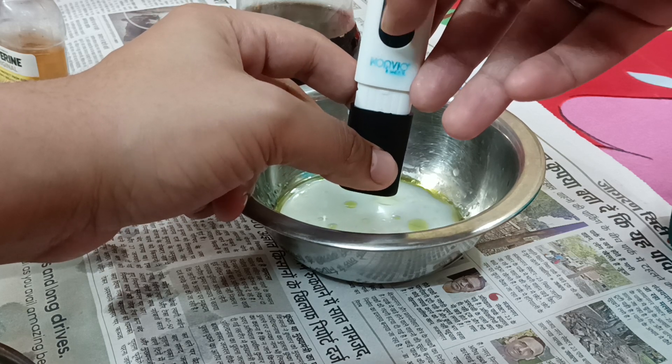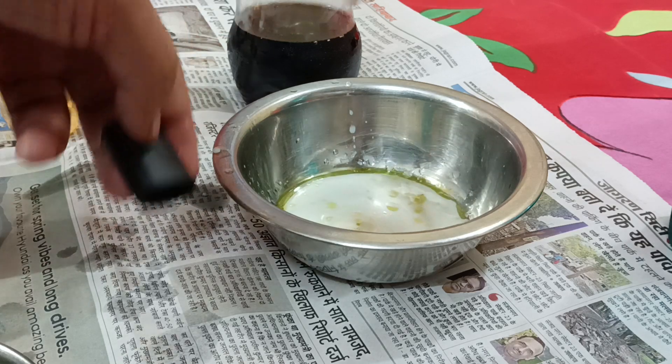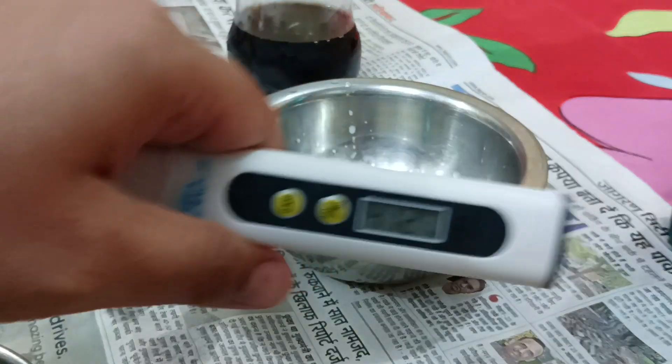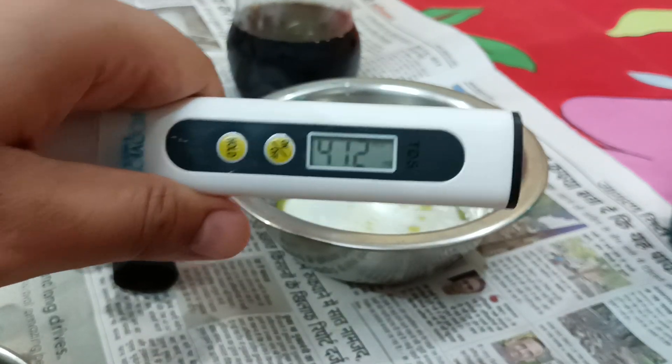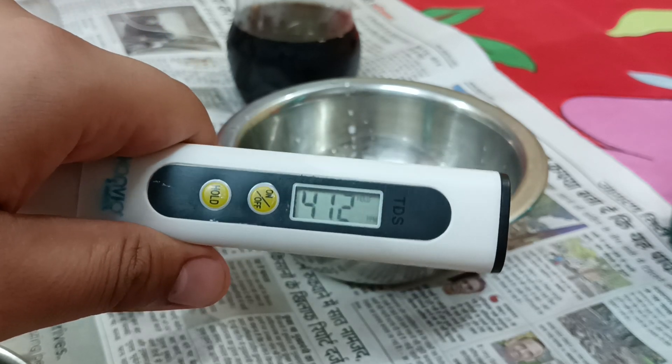It is dipped in and we have the reading. We can see that the TDS of Thumbs Up is 412 — four hundred and twelve.